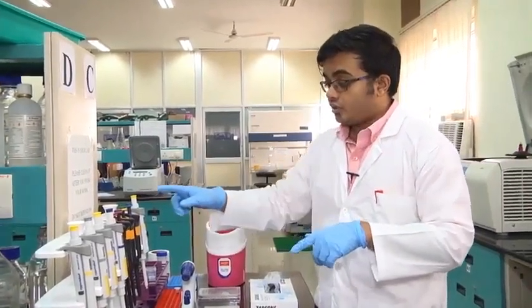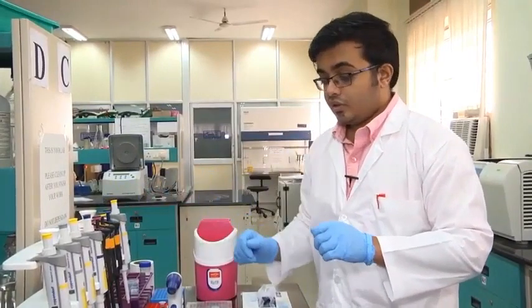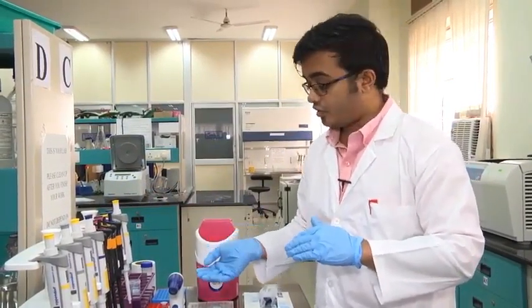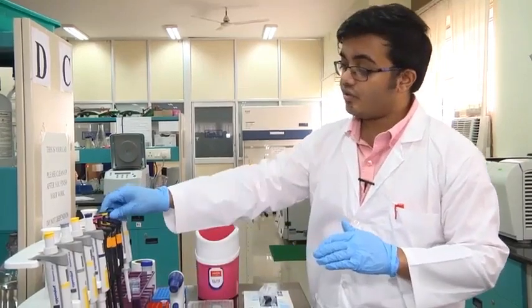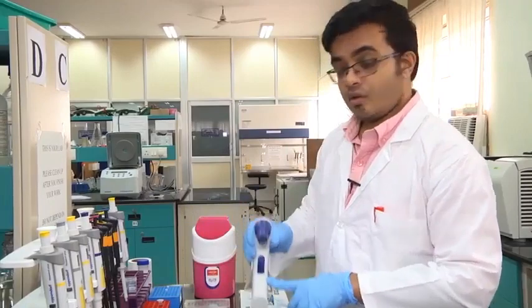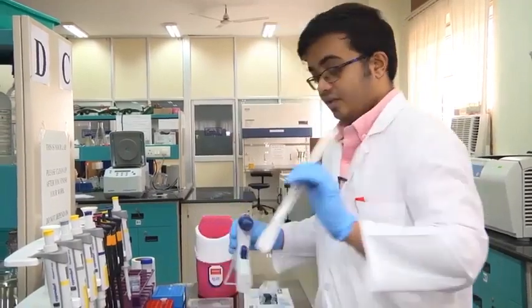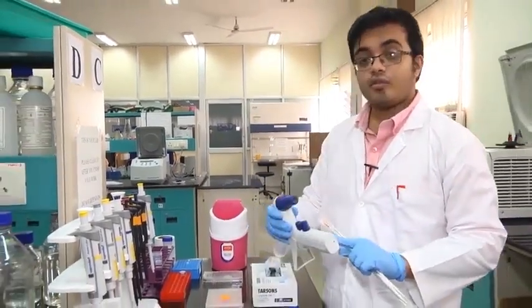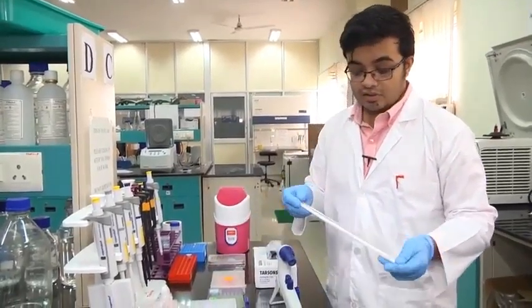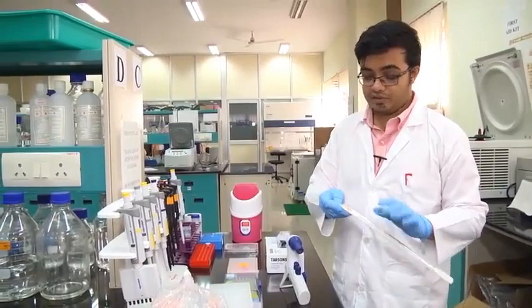So I had been talking about collecting 1 ml. Suppose I want to collect 5 ml or say 10 ml of a particular solution. In which case, instead of using this 10 times, I would like to use this once. This pipette controller does not use these sort of tips. Instead, they use serological pipettes.